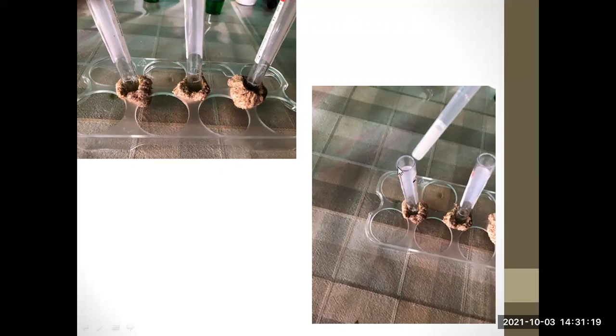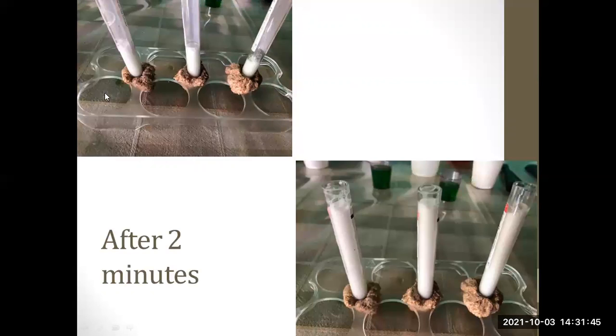And then I added half a milliliter of the yeast solution, which is where we have the enzyme, the catalyst. So I added half a milliliter, which is half the capacity of that dropper that I'm using, to each one of them. And prior to that, I had timed my phone to 2 minutes so that I could start the timer as soon as I put the enzyme in the test tube. So this is how it started, and after 2 minutes, foam went up, way at the top. Just after 2 minutes, it went by very fast.